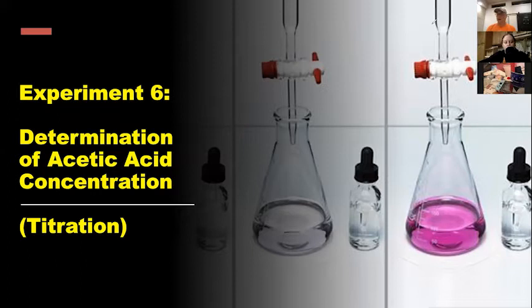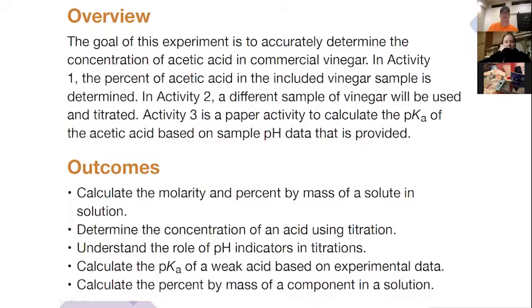And you're doing that by knowing what the reactants are, how they react with each other, and we need something to tell us when the reaction's over. What are we going to be using to determine when our reaction's over in this experiment? Sodium hydroxide. That's one of our reactants. Oh, is that phenolphthalein? Yeah, right, there you go.